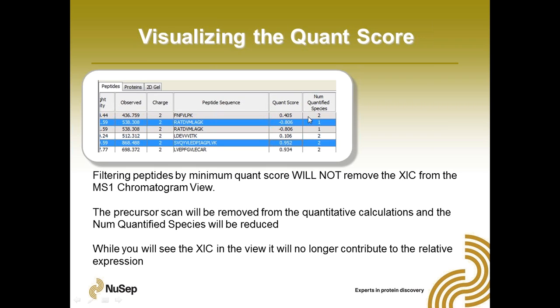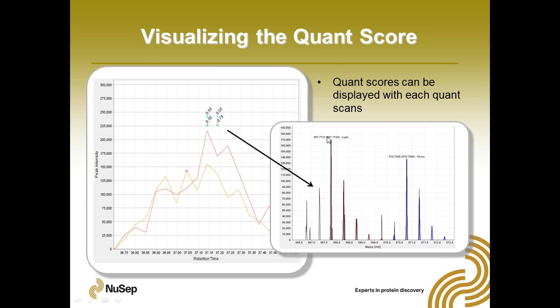So in this example, this is a SILAC data set. We have a light and a heavy species. So we have a total maximum number of quantifiable species of 2. If I go back, we have 2 possible quantifiable species, a light and a heavy.